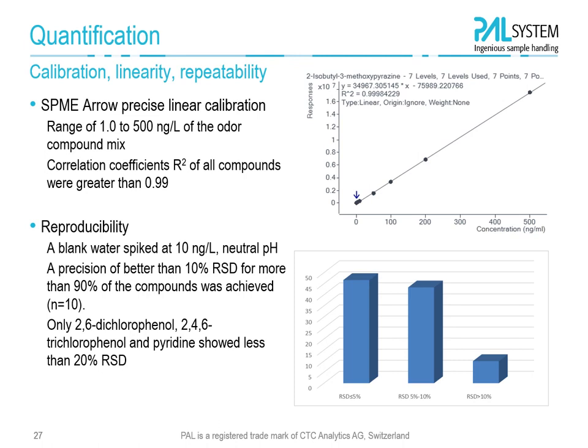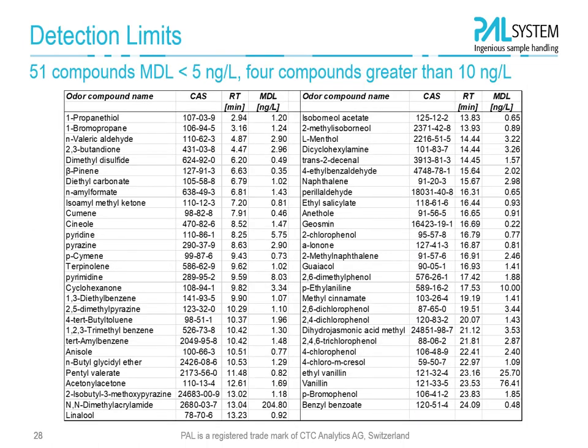The only exceptions are the acidic phenol compounds. We did not do a derivatization for these compounds here. We see in this list all the compounds from the light VOCs, the first one is propane thiol at 2.9 minutes in retention time, down to the late eluting compounds with benzyl benzoate at 24 minutes retention time.